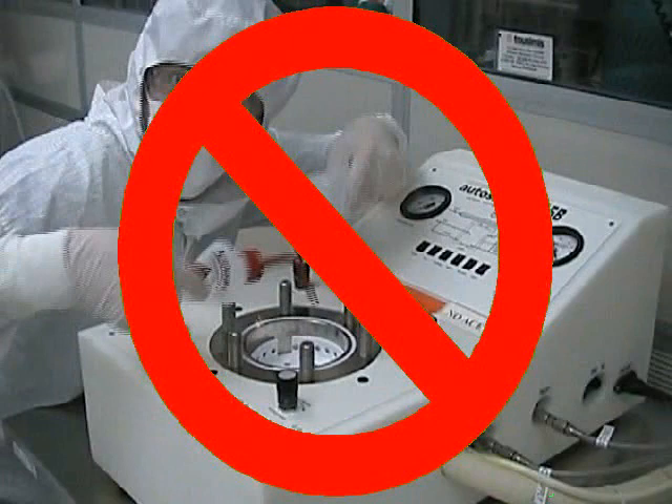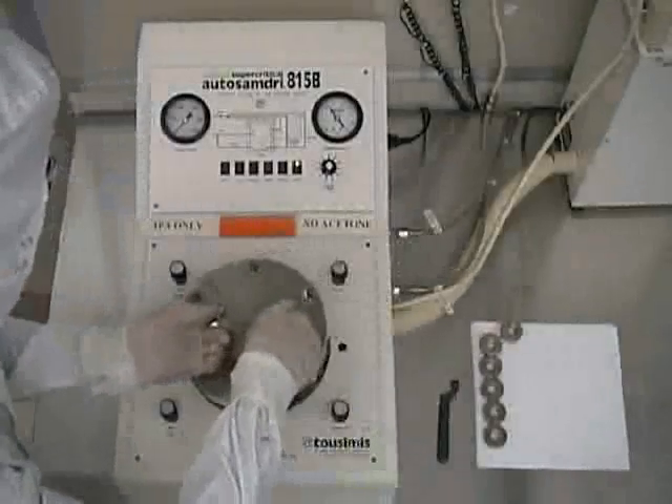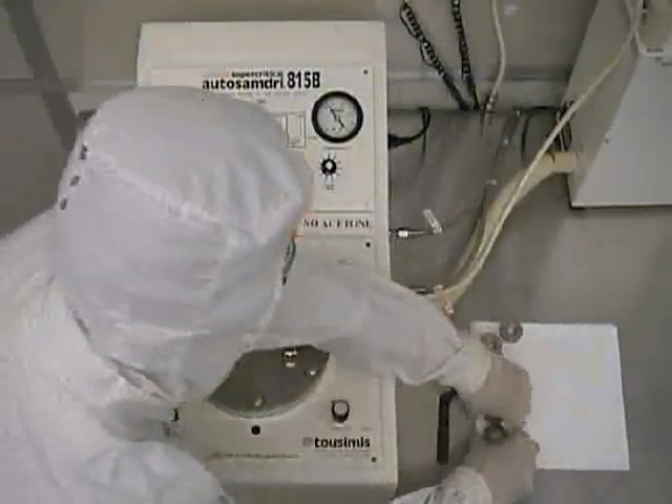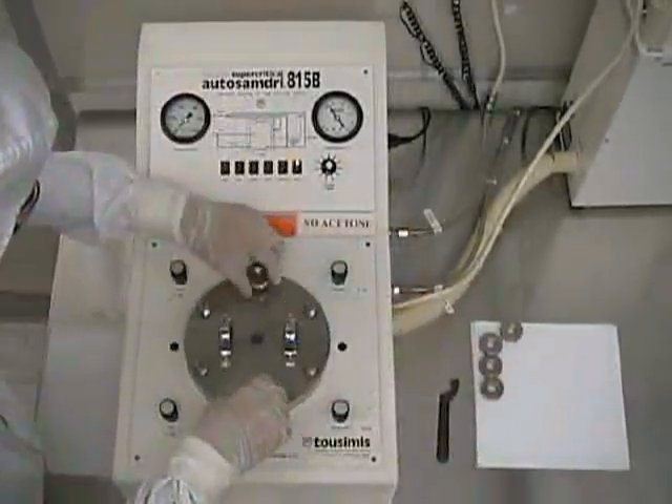Never expose the chamber to any chemicals other than IPA. Acids or solvents other than the approved alcohols can damage the chamber. You should now carefully place the chamber lid on top of the chamber, then tighten the six knurled nuts around the circumference of the chamber lid using your hands.